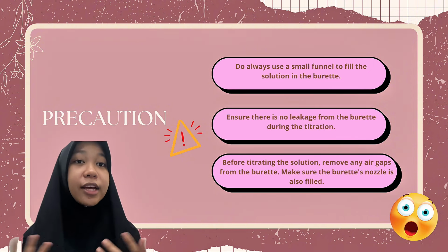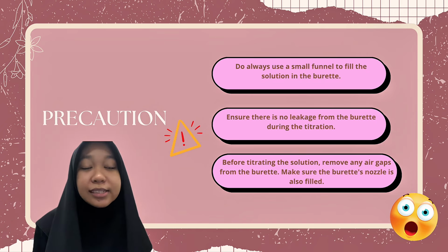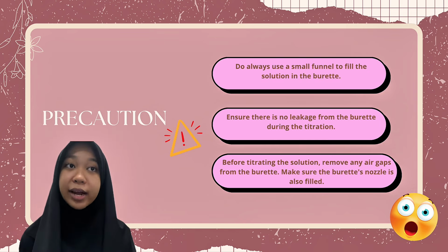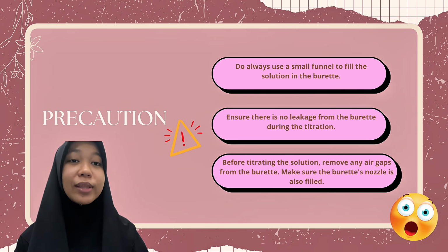Other than that, ensure there is no leakage from the burette during the titration. And lastly, before titrating the solution, remove any air gaps from the burette. Make sure the burette's nozzle is also filled with the solution.